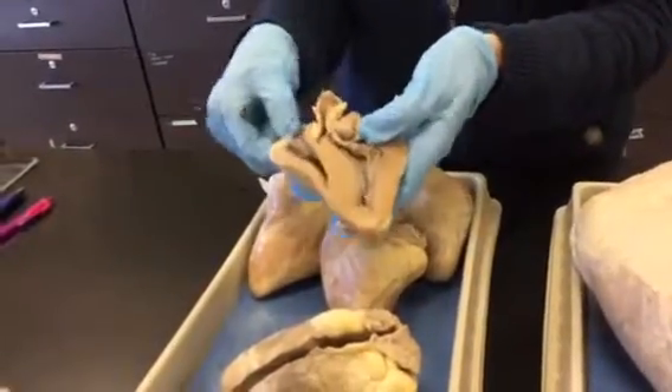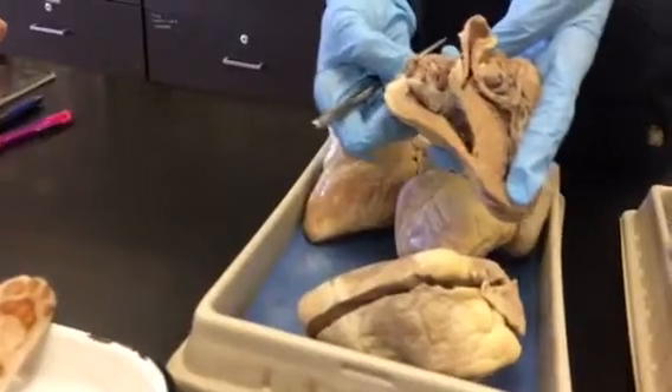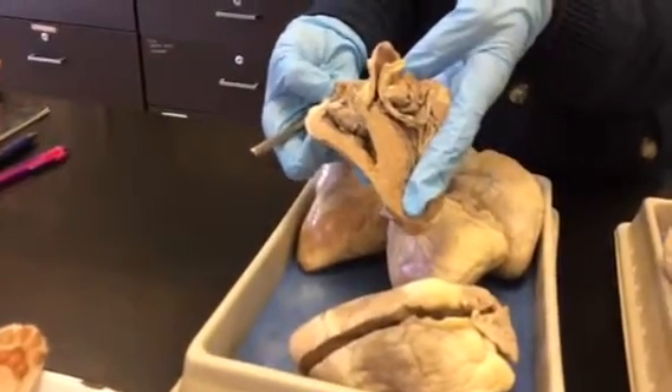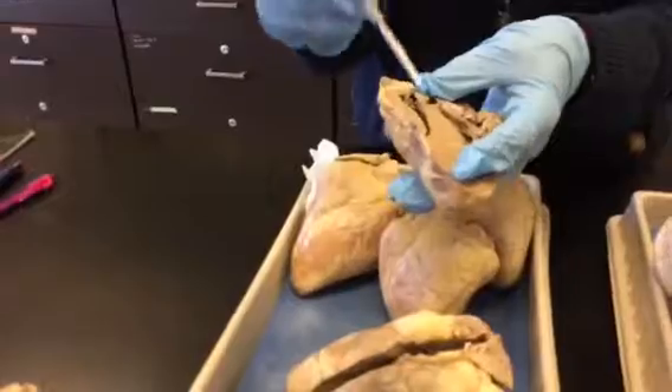Let's start at the right atrium. Here I'm going to open up that right atrium. You see all those ridges there? That's pectinate muscle, because the atrium is muscular too — it has to contract. So that's the pectinate muscle in the atrium, and it's going to contract and send blood down to the ventricle.